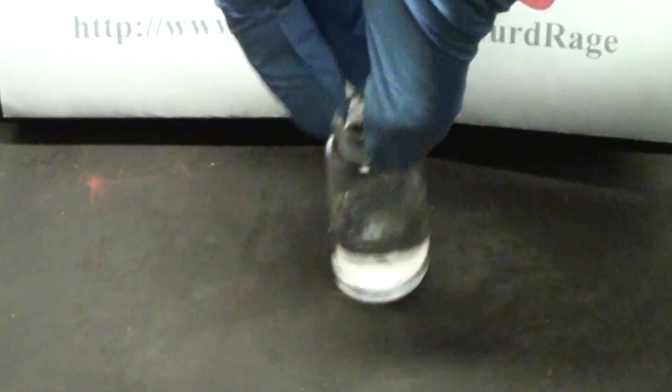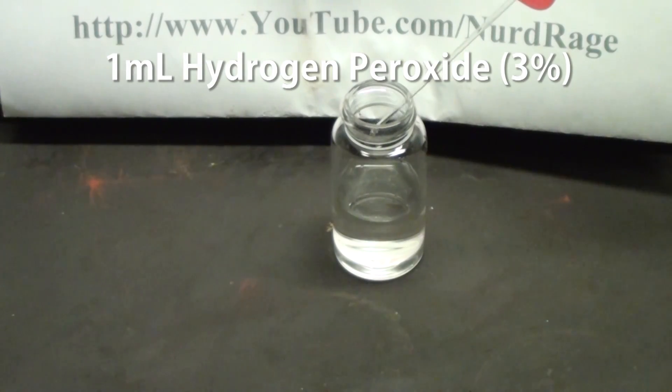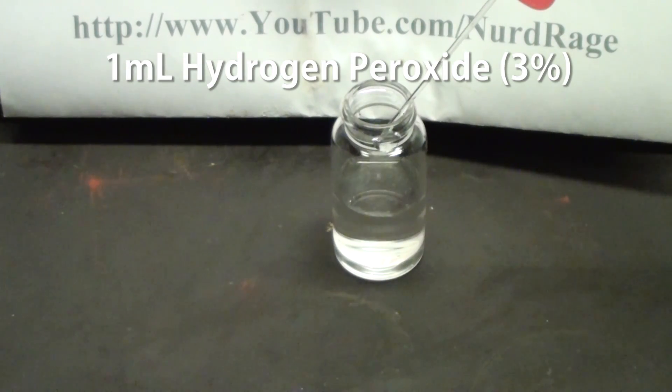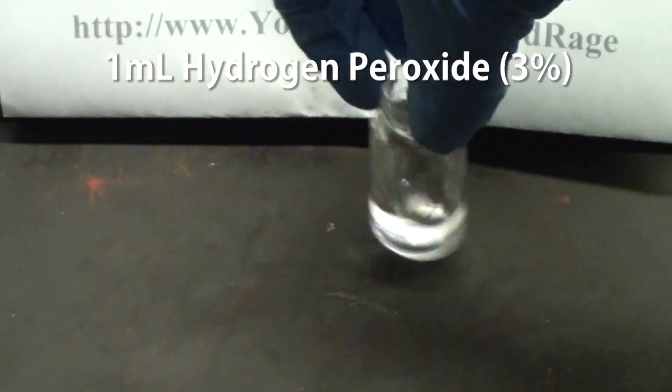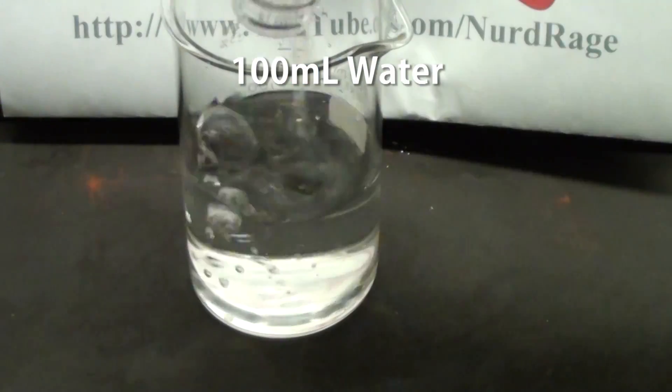Shake it up until it completely dissolves. Now add in 1mL of 3% hydrogen peroxide and then dilute out the solution into 100mL of distilled water.